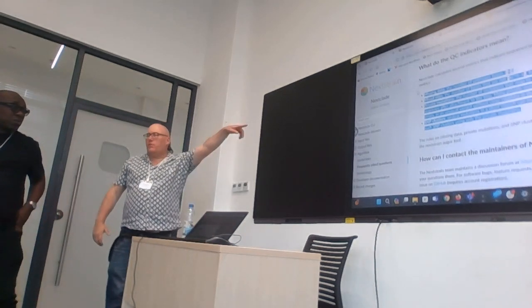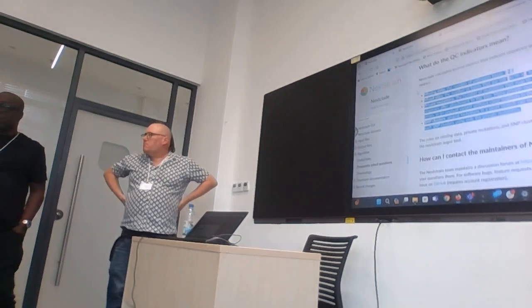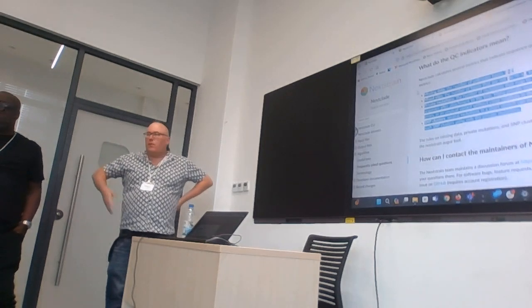So each letter is one of these things. Anyway, there was a question. And then, yeah, go ahead.